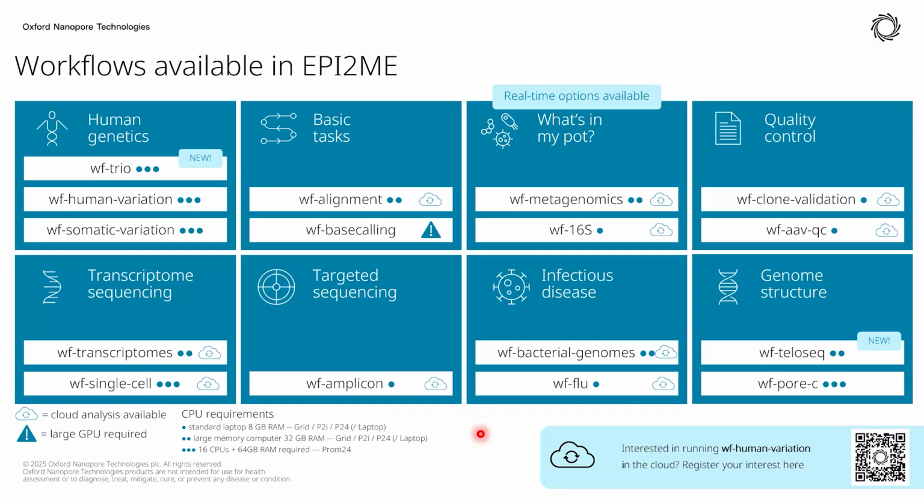yet. We have an amplicon workflow. So if you do sequencing of amplicons and you want to analyze them, the workflow will align them to your references, or basically de novo assemble them into clusters and provide you with those sequences at the end.